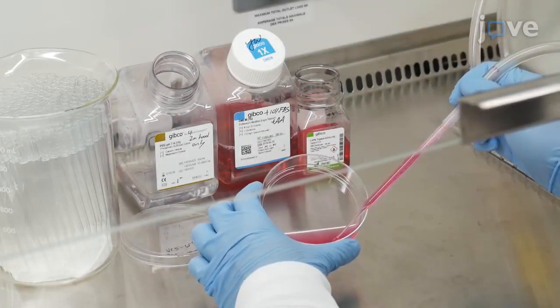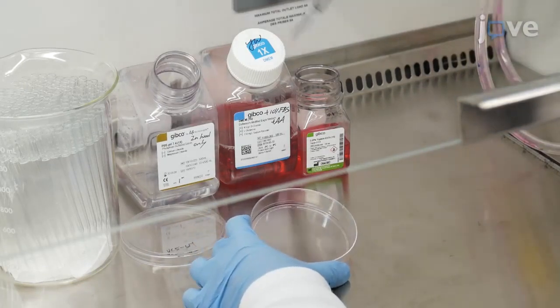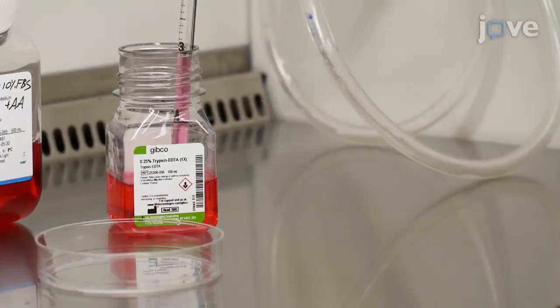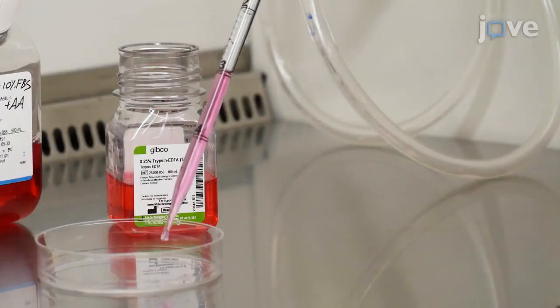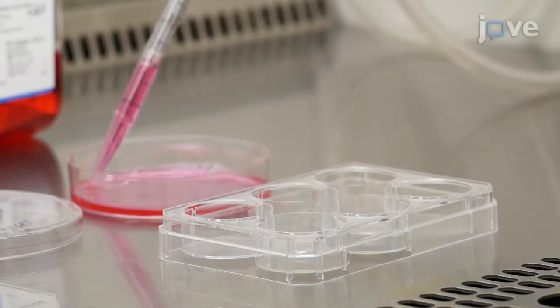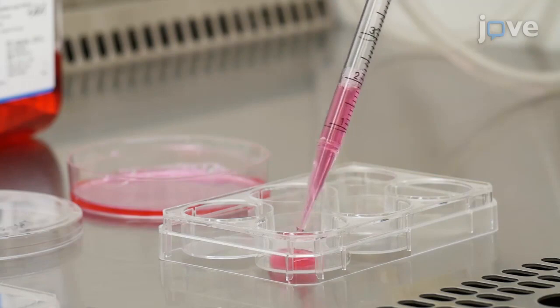To begin generating spheroids from cell lines, culture human bladder cancer cells under conventional adherent cell culture conditions. One day prior to the experiment, trypsinize the cells and distribute one million cells in three milliliters of cell culture media to each well of a six-well plate.